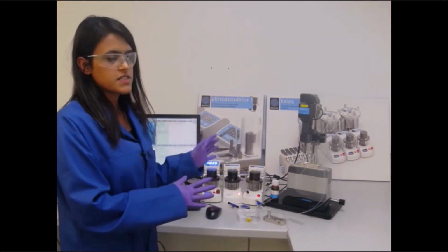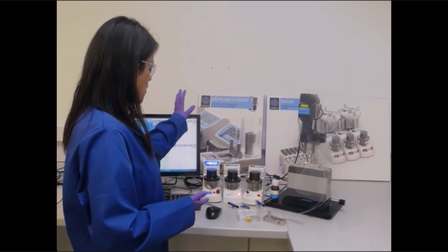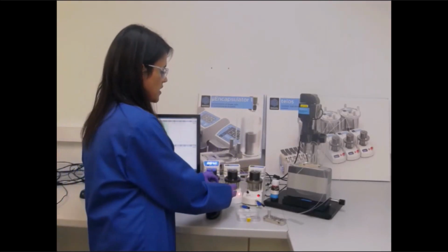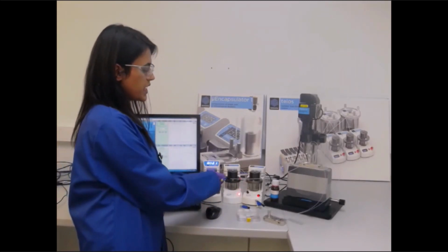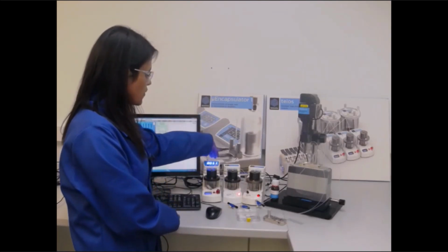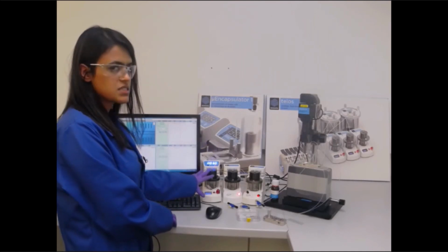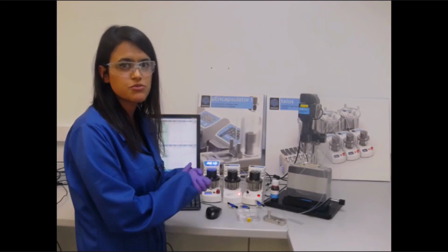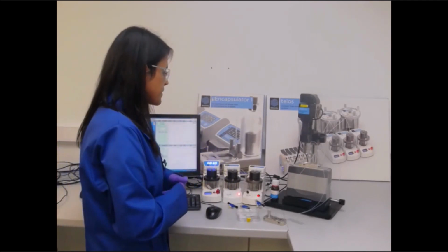So what we've got here is the system that I've just been showing you, our microencapsulator system. We've got the 3 P pumps, our pressure pumps. They are all connected via this tubing. We've got some inline valves in place, which allow me to manipulate the flow in real time. You can see that one of the P pumps has a digital display. This is our advanced pump, and these 2 are our basic pumps. Although they both do the same job, this just allows you to do something manually rather than use software.